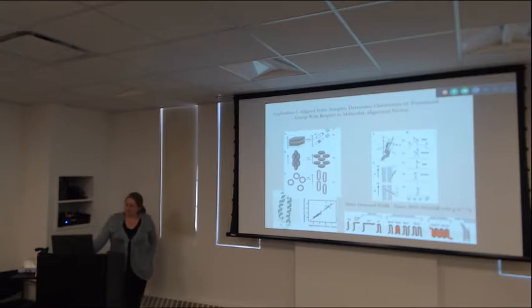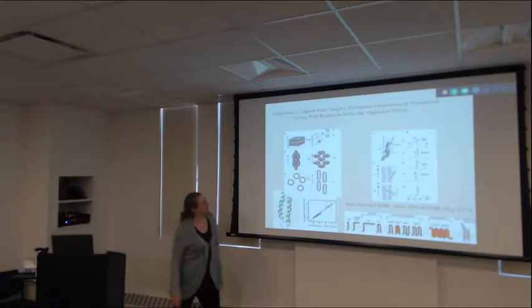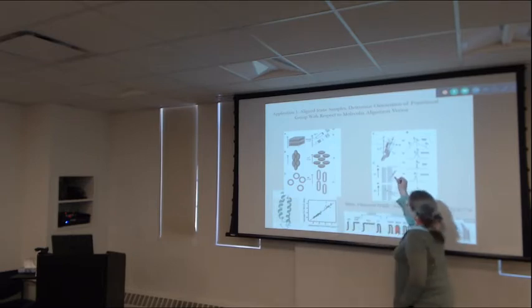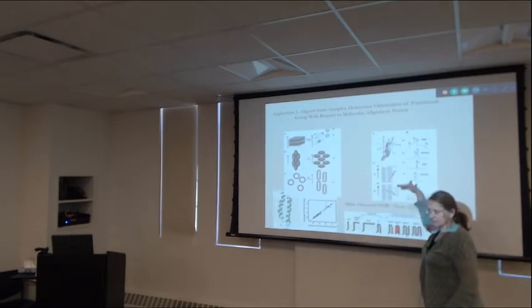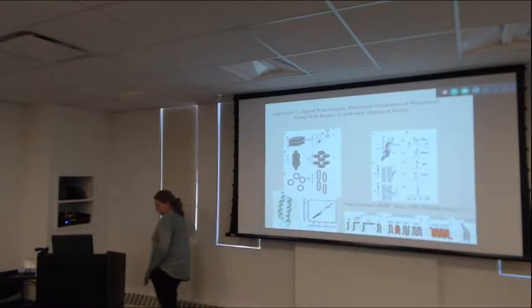So these anisotropic interactions have applications in biophysics when people align samples in a membrane and then align those membranes with respect to an applied field. I mentioned before the work of Cross or Opella in particular, and here's a nice review article from Nevzorov et al., 2009. So by using these anisotropic effects, if they have an assignment for a species, they're able to figure out if a particular amide may be pointing this way versus that way compared to the membrane normal. And if you get enough such information, you can begin to make a structure for that molecule. That's the idea.